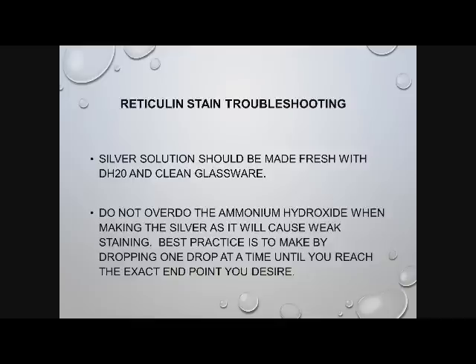When you're done mixing the silver with the sodium hydroxide and then adding the ammonium hydroxide to it to clear it up again, you want to make sure that you have some little black pepper-like flakes in the bottom, and leave those in there, just a few dozen. And that means you haven't overdone it with ammonium hydroxide. It's a good way to check yourself.